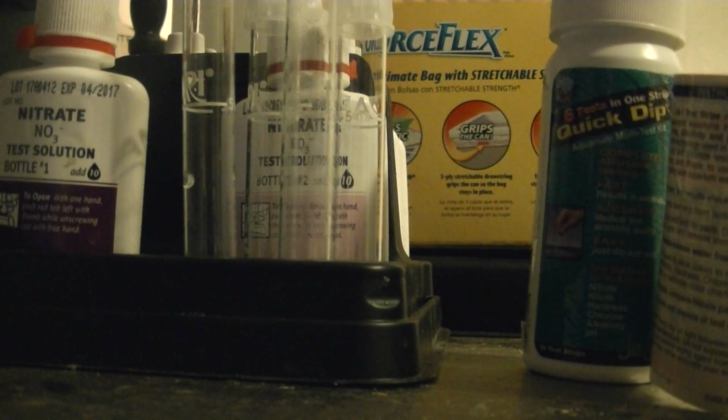Now 40 parts per million is okay, but it's on the high level for a fish only tank. You really want to stay under 40 parts per million, so that'd be pretty high. So I'd want to do some water changes pretty quick right now if that's what it really was. For a coral tank or stuff with lots of other things in the saltwater world, you'd want to keep it actually lower than that, probably under 20 parts per million for a fish tank and under 5 parts per million for a coral tank. But let's go ahead and test this.